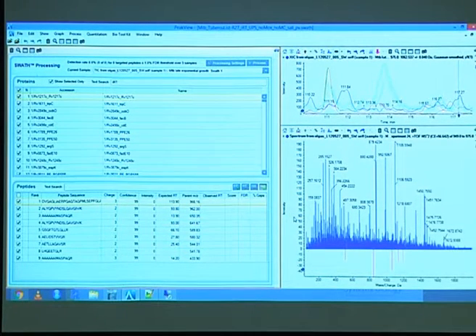In this particular case, the retention time of the library is normalized and is in iRT space. That one starts at -50. So they're all shifted. That's why you don't see anything here. So you have to do the retention time normalization in order to get that right. What else do I have to do?